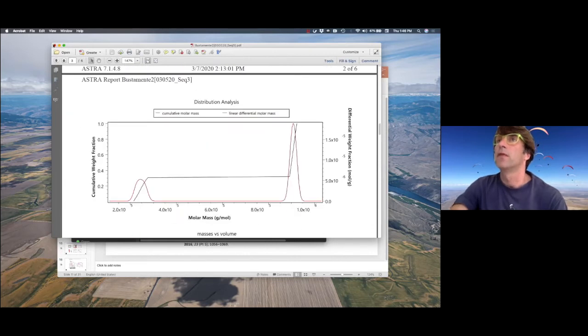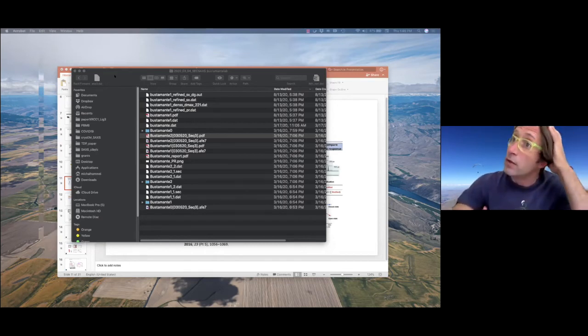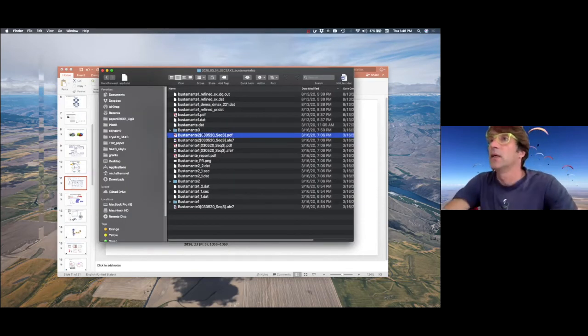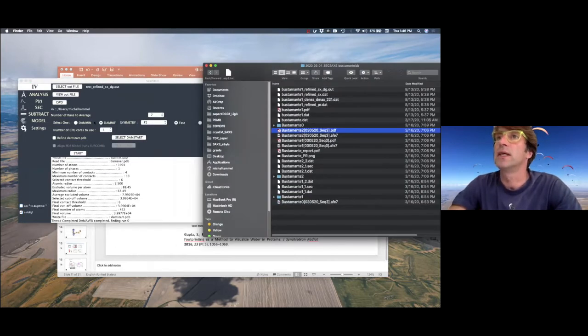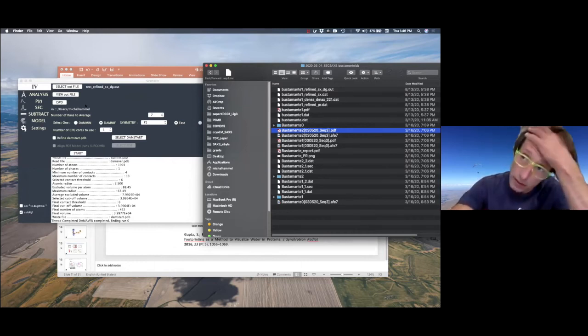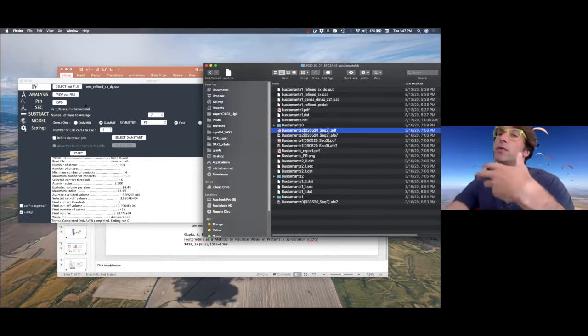Okay, so all this information is from before you do some data processing. That is in your package if you really want to reanalyze the data, and I will show you some examples. There'll be some questions about how to look at the data that you get and how to process this further. And I think it's a good scenario now.